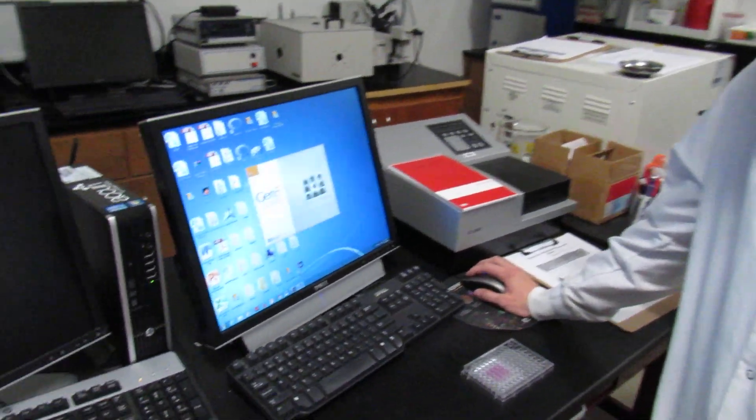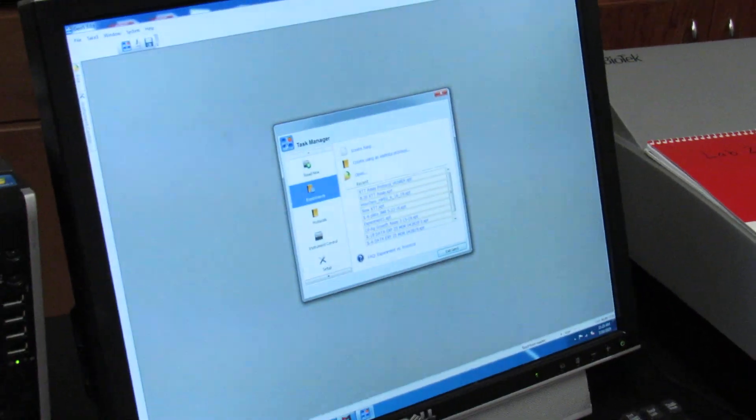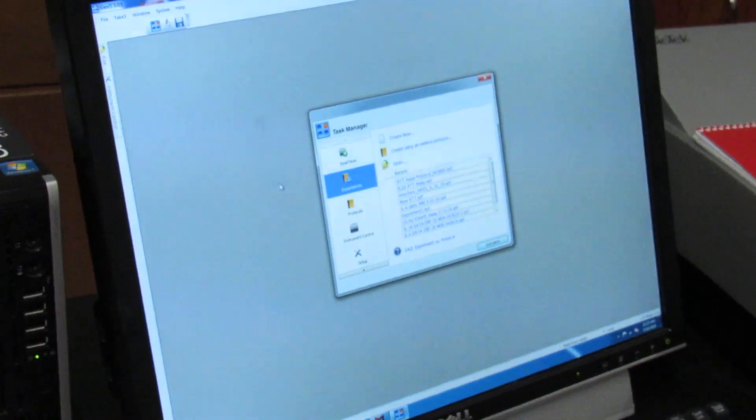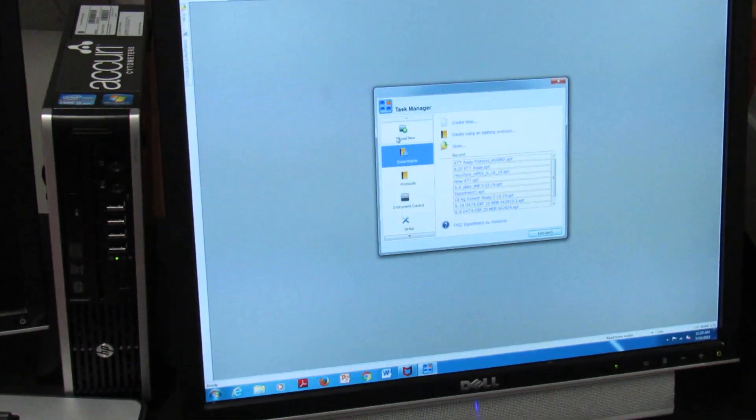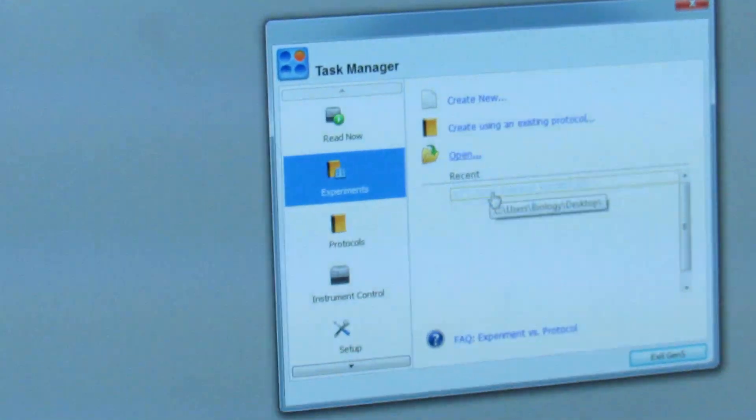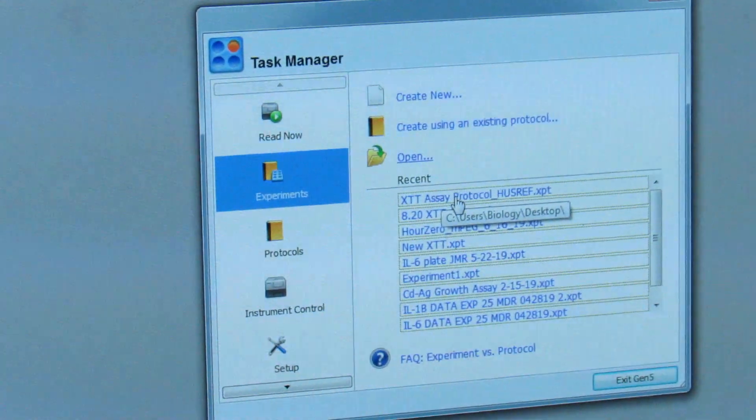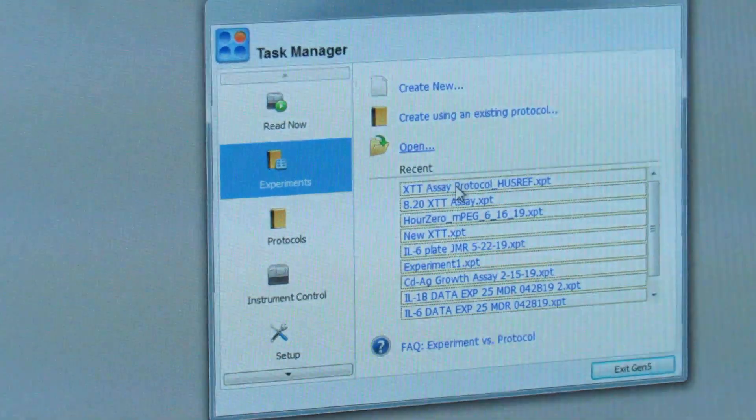To do this, open up the Gen5 Microplate Reading software and you'll get this task manager screen. On the task manager screen, you will select XTT assay protocol as well as my name, your host.